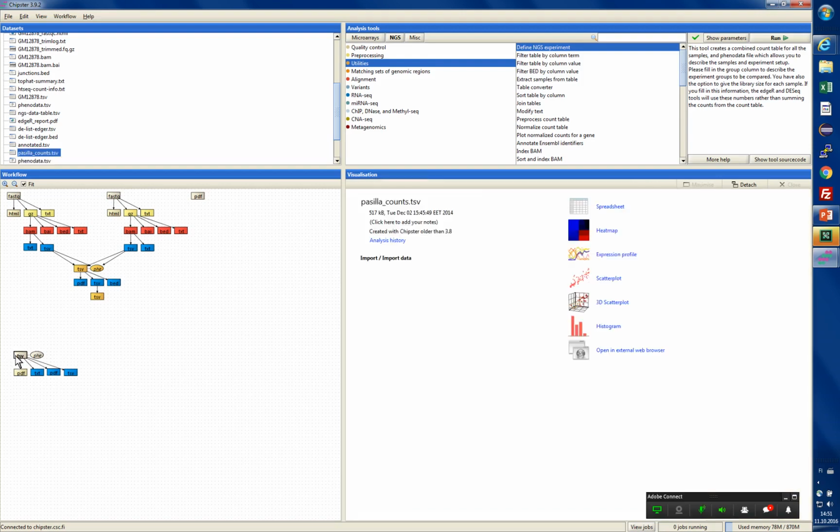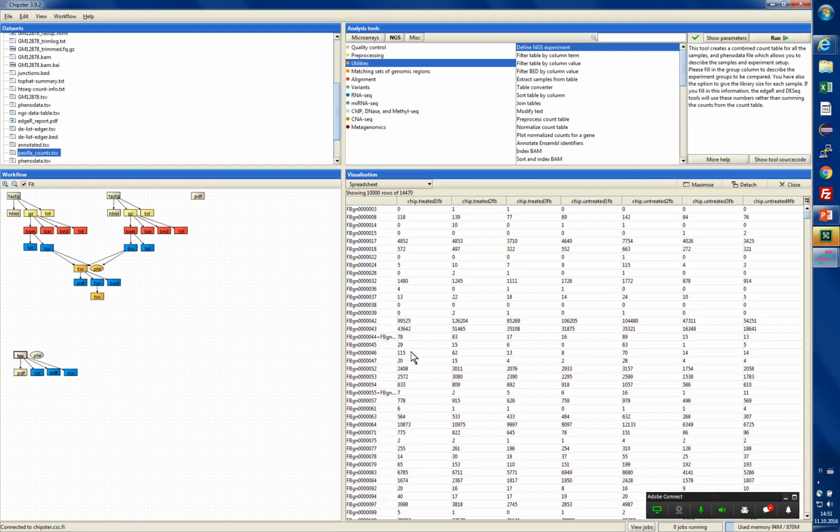And if you look at the actual count file, here you can again see the different samples. Here we have the gene names. These are FlyBase identifiers for Drosophila. And then how many counts does this gene have in the different samples that we do. So you can see that the count levels vary quite a lot between the genes. Now Maria will continue from that, discussing the PCA plot.